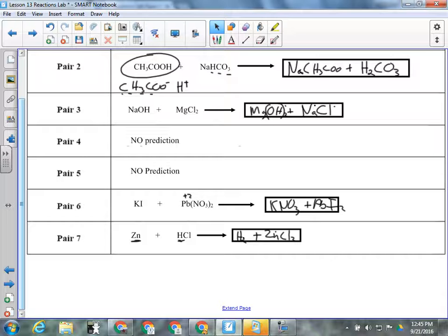When we go across to the lab very quietly through the hallway to the biology lab, we are, first off, going to get what? Safety goggles. They aren't the nice ones like we have in the chem lab. They're the old-fashioned kind that are ugly and uncomfortable, and you will wear them anyway. Okay? And they will stay over your eyes at all times. If you want a lab coat, there are lab coats in there, but that's the biology lab. They're covered in gore. Okay? That's pieces of the dissected things that they dissect in there. All right? It also smells funny in the biology lab because the formaldehyde they keep everything in smells bad.